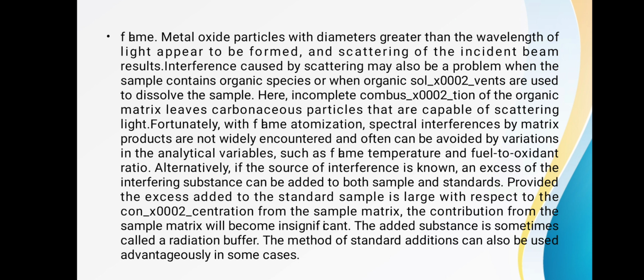The added substance is sometimes called a radiation buffer. The method of standard additions can also be used advantageously in some cases.